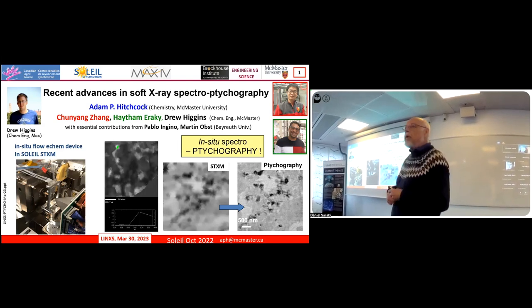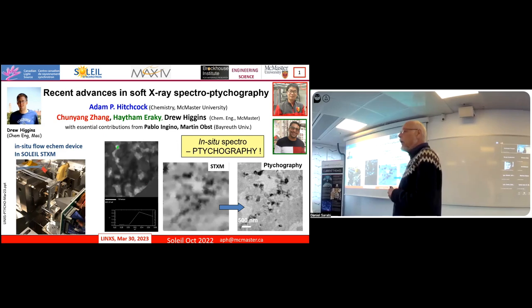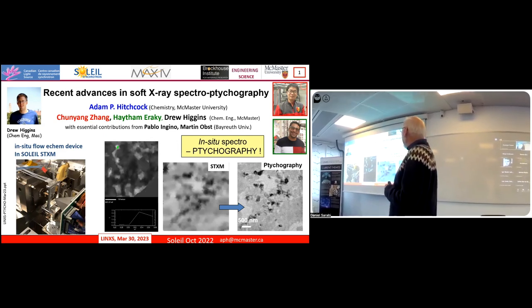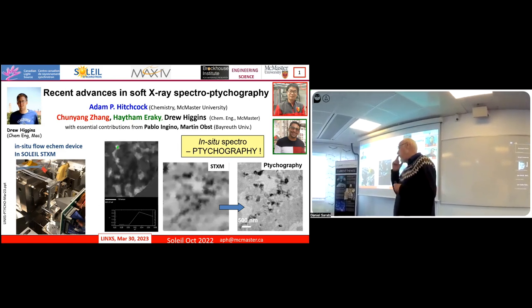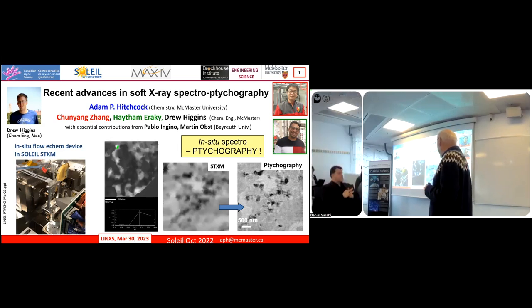And the other person I want to mention at the beginning also is my collaborator, Mark Pomps, who really helped set up the CLS STXM system. But very recently, he's made some tremendous advances in the technology for doing in situ full electrochemical systems in STXM, the soft X-ray STXM area, which, as you will see, is quite challenging. And it's really due to the creativity of him and his student that we were able to do the experiments.